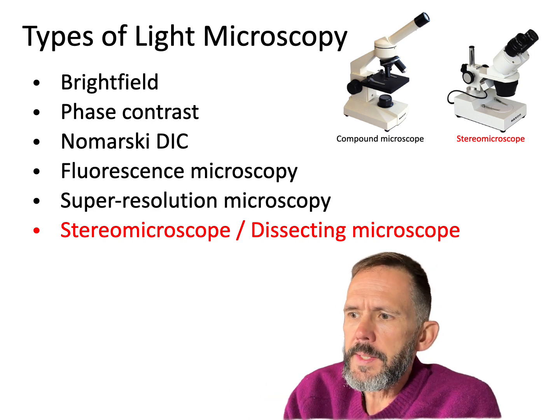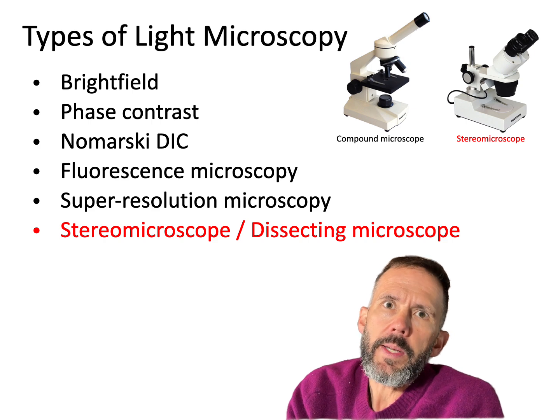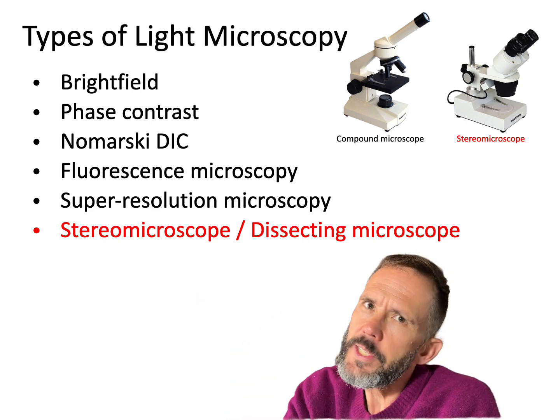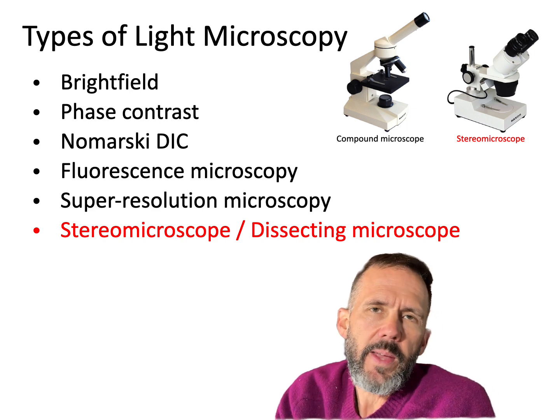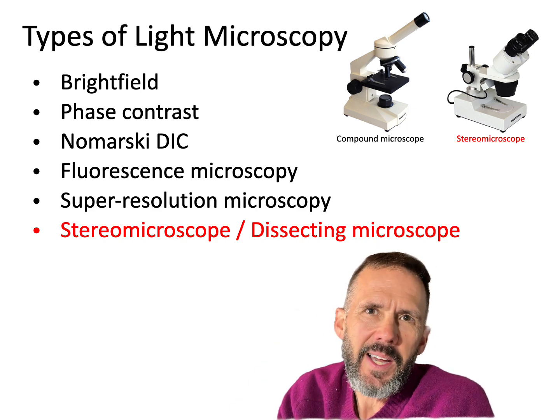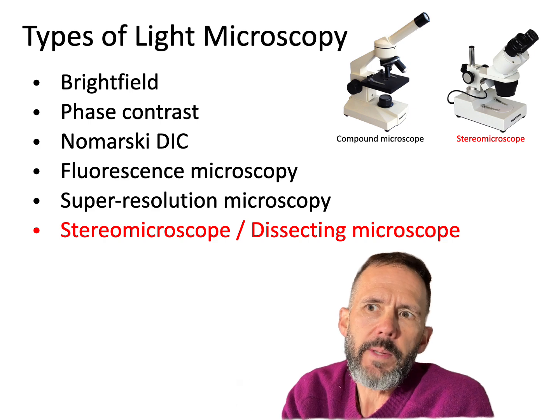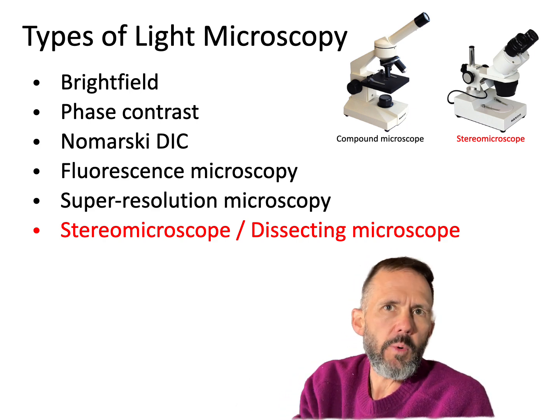They use a variation on standard microscopy where the samples can actually be manipulated, and then a high-power computer can back-interpret that manipulation to break the limits of resolution that we haven't been able to break since Robert Hooke, right, for hundreds of years. Light's been light. But now with computers, we can use some tricks to break the limits of resolution that we couldn't before with light microscopy.